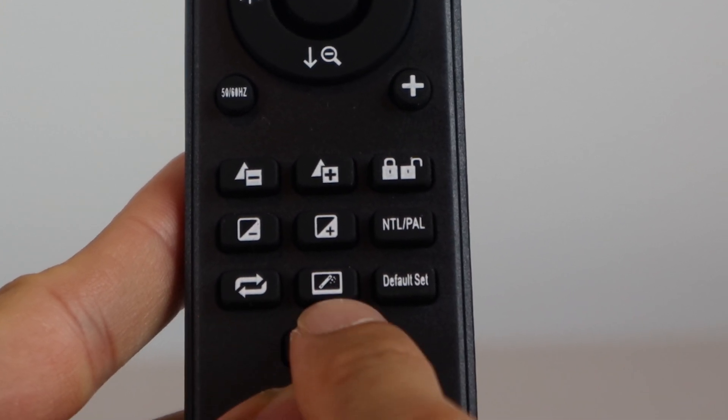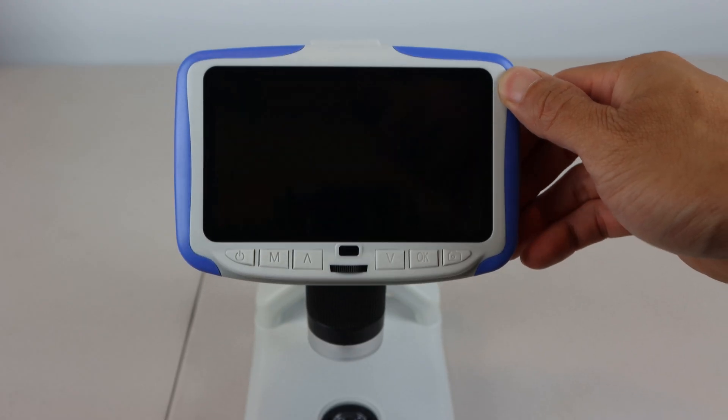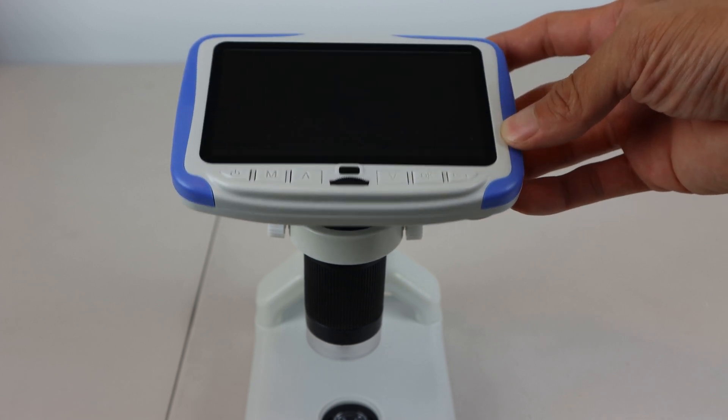There's negative inversion, black and white toggle, default settings key, and screen rotation. The screen's viewing angle is also adjustable, about 60 degrees.